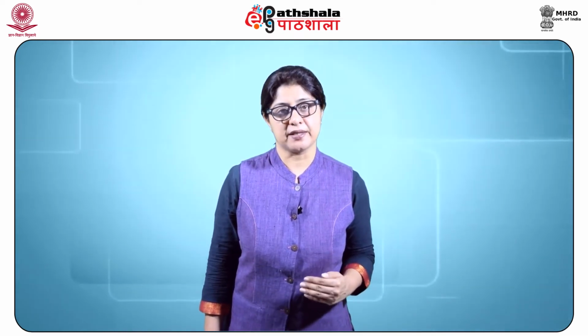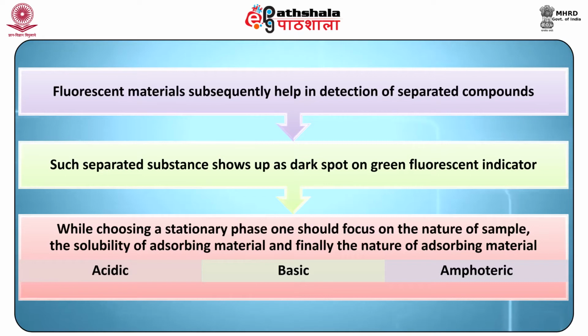In real practice, thin layer chromatography utilizes inert fluorescent ingredients such as zinc silicate in coating materials, and the addition of these substances does not change the chromatographic characteristics of an adsorbent. These fluorescent materials subsequently help in the detection of the separated compounds.